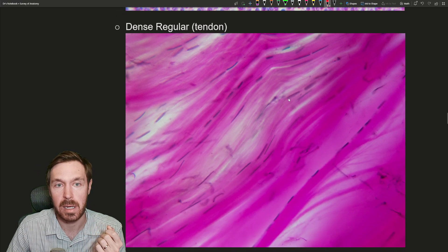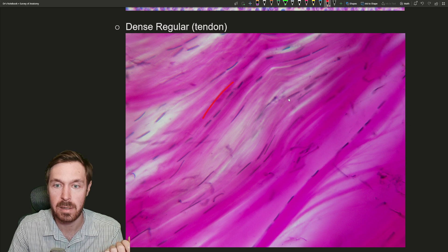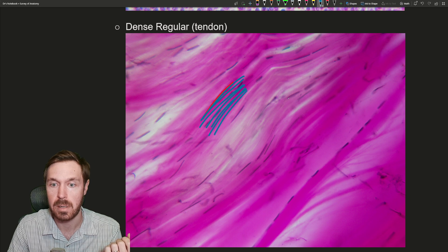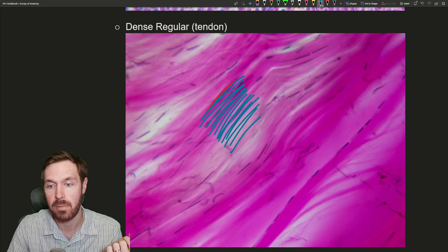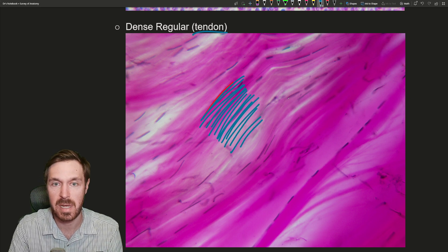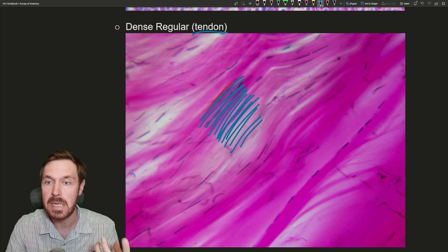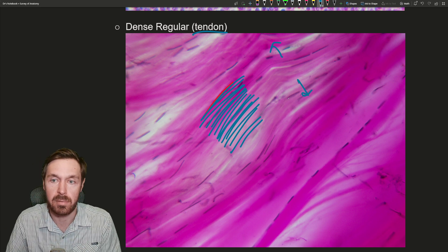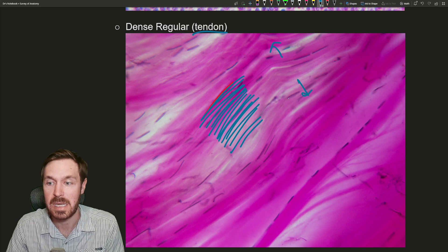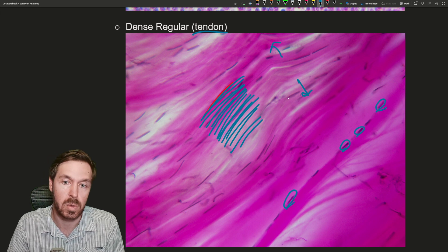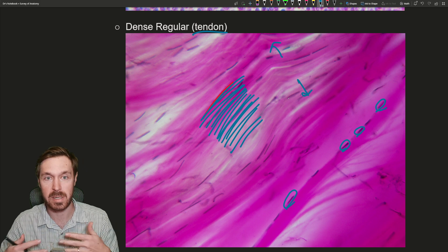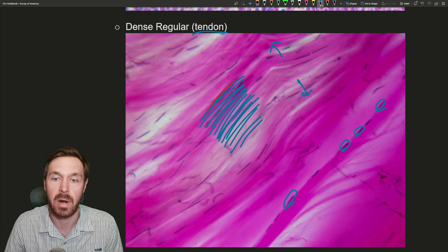Next is dense regular connective tissue. Here we see a dense arrangement of collagen fibers running in the same direction — you can see the little lines in this tendon. This is an example of a tendon, and tendons are often teased when imaged, which pulls the fibers apart slightly to allow more light through for microscopy. You might see them written as teased tendons. Right here you can see the nuclei of the collagen-producing cells. In dense regular, all fibers run in that regular direction.